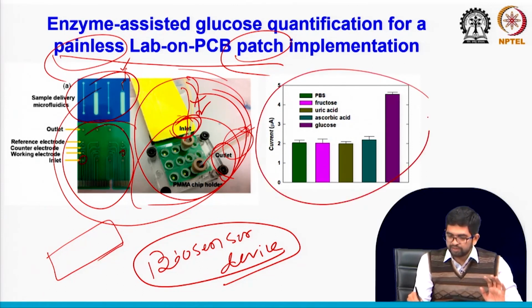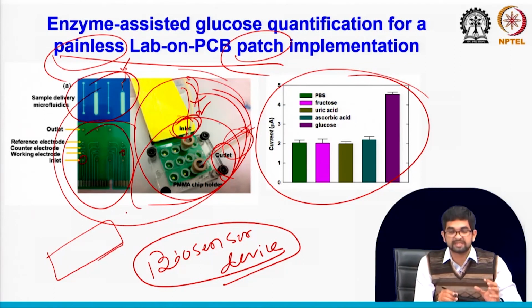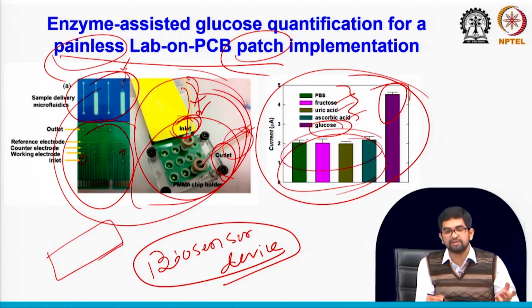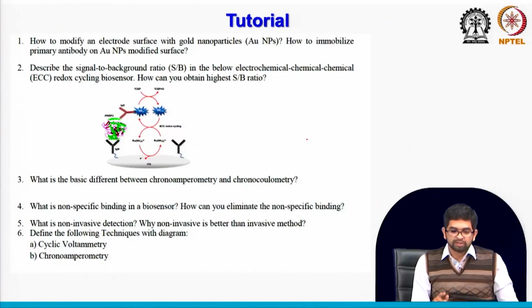So keep in mind that when you develop some kind of patch sensor or any real-sample-based biosensor, you have to think about an interference study. Because with a real sample you may have fructose, uric acid, ascorbic acid along with glucose. You are detecting glucose, but you may have other interfering species. They should not show much background current, right? That's why we measure some others also. See, your glucose is here, but fructose, uric acid, ascorbic acid, and others are not showing much background current. So your sensor is ready for glucose detection, because in this real sample not much interference effect is present. Okay, so that's all for today.